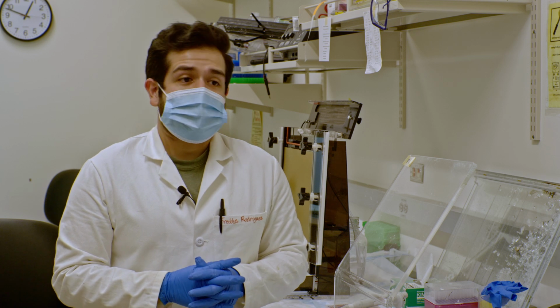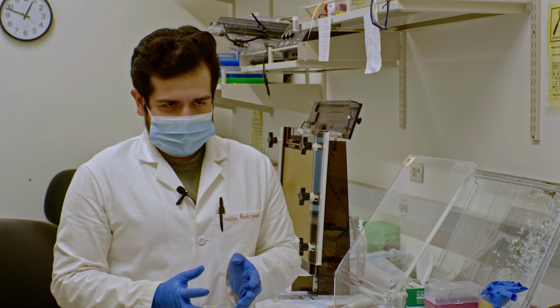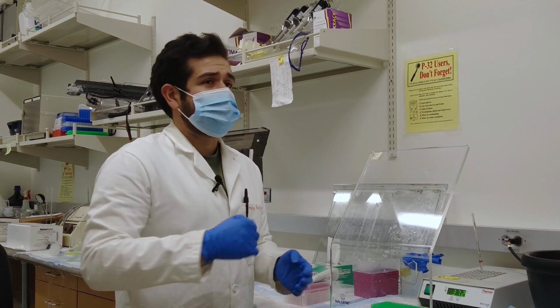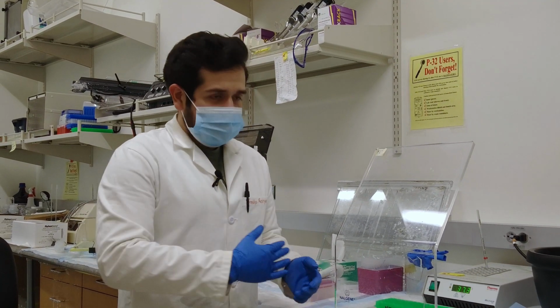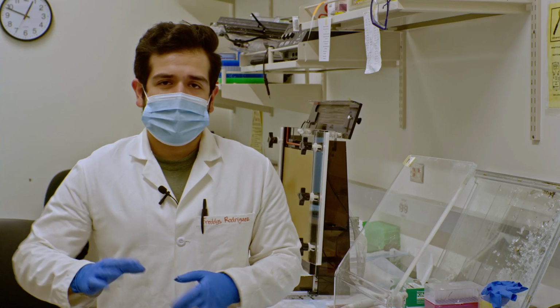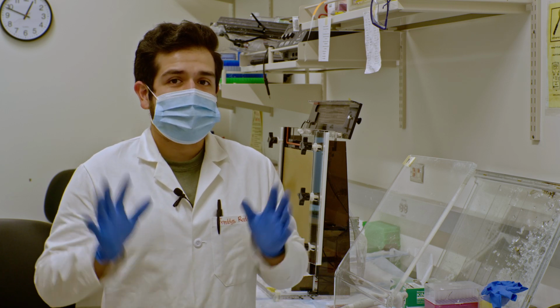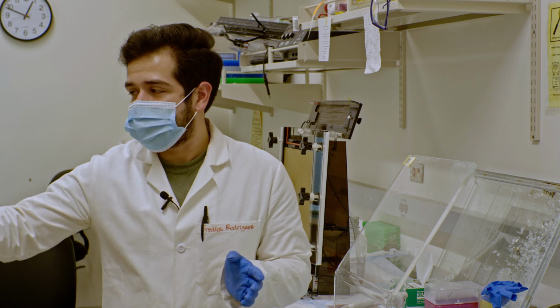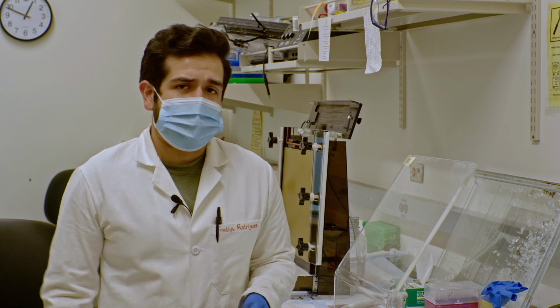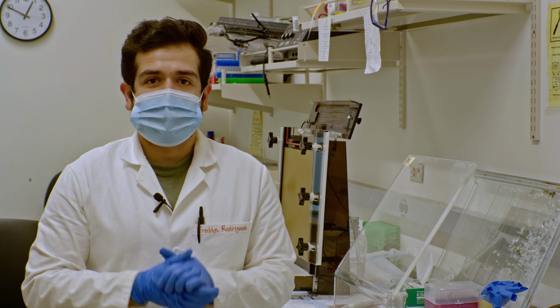And then the last thing that I think is a good idea is to have your Geiger counter on at all times. Now, the Geiger counter really is only to make sure, whenever you get out of the room, that you're not carrying any radioactive materials on your lab coat, under your shoes, or on your hands. We'll talk more about that in a little bit. But I like to have it on at all times during the experiment, just in case I do contaminate my hands. I don't want to all of a sudden contaminate the whole Geiger counter apparatus, and then I'm touching things and spreading it everywhere. So it's always just a good thing to have in mind. So the primer extension assay.